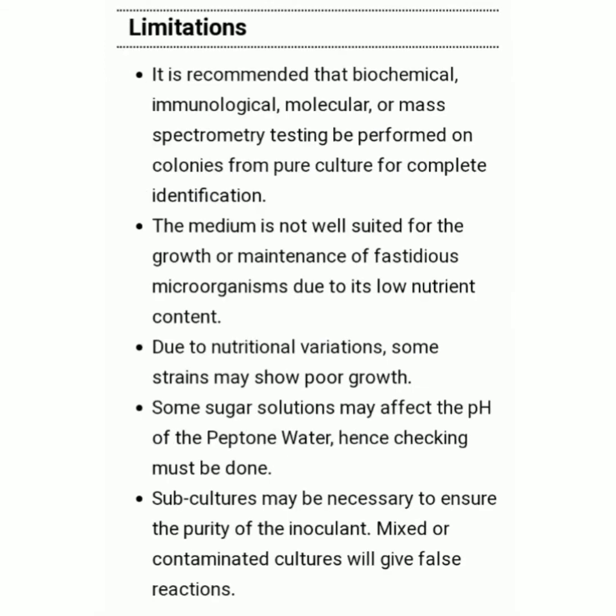Here are some limitations of the medium. It is recommended that biochemical, immunological, molecular, or mass spectrometry testing be performed on colonies from pure culture for complete identification.